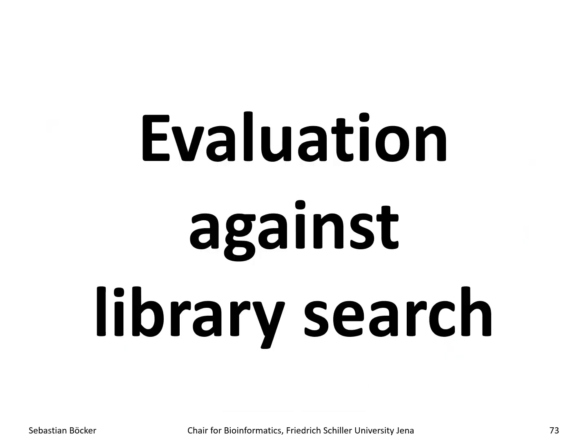Now, we also evaluated against library search. The difference so far was that all of the evaluations were carried out structure disjoint, which means, as in the case of CSI FingerID, we searched always assuming that the compound or the structure is not contained in our training data. Structure disjoint. Obviously the spectrum itself is never in our training data. Watch the CSI FingerID talk for these differences, but we went several steps further.